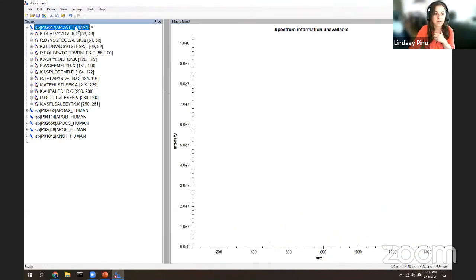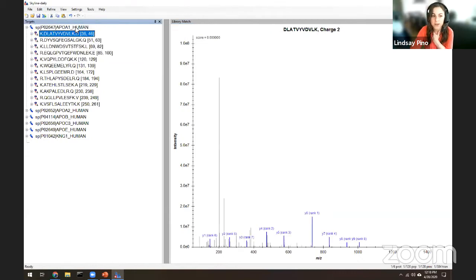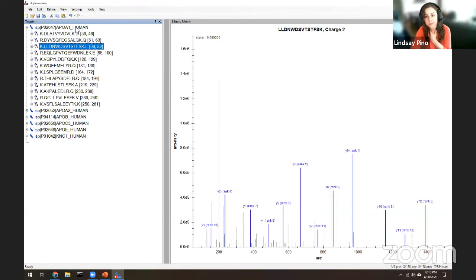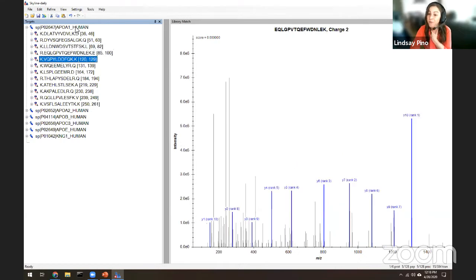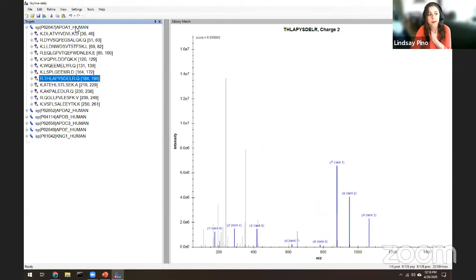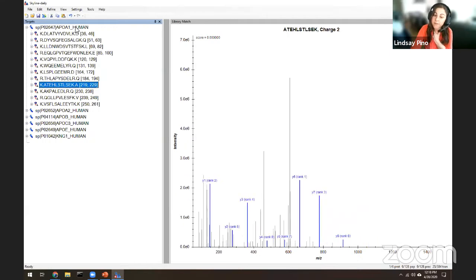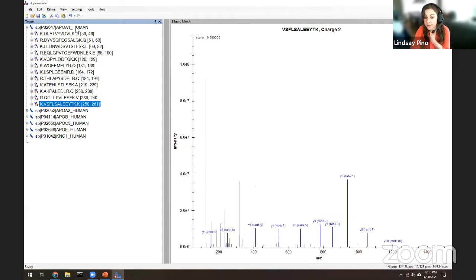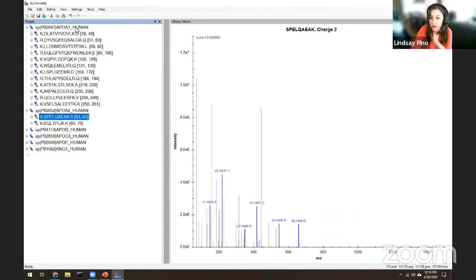So as we go down for some of the different potential candidate targets for these proteins, we can also start eliminating peptides, precursors that did not fragment very well. So like I had mentioned in the lecture portion, we don't need to measure more than 2 or 3 precursors per protein. So if we see some precursors that have better fragmentation than others, we can eliminate the poor fragmenting precursors from our target list before we've ever even gone to the mass spectrometer with a sample.